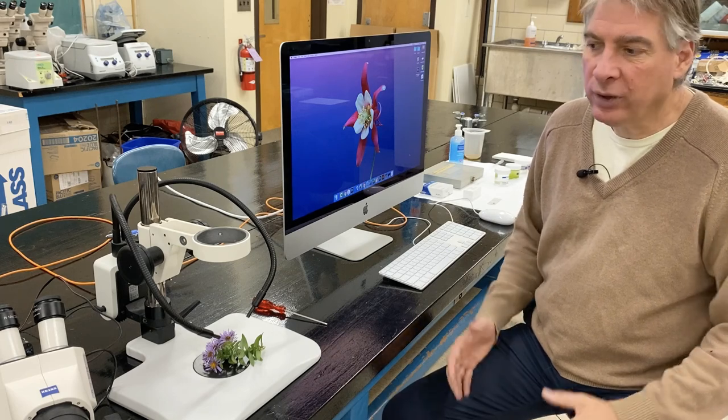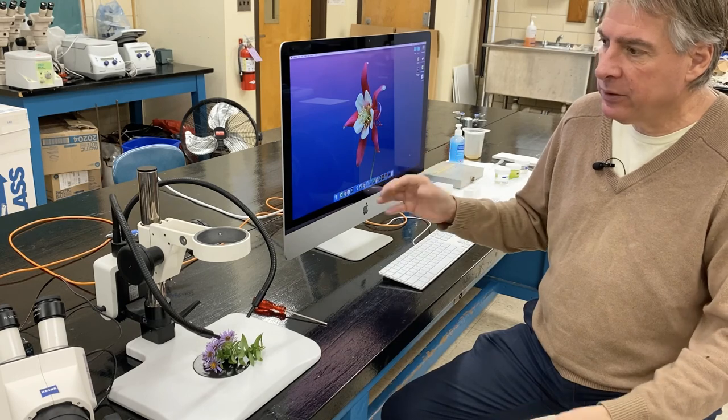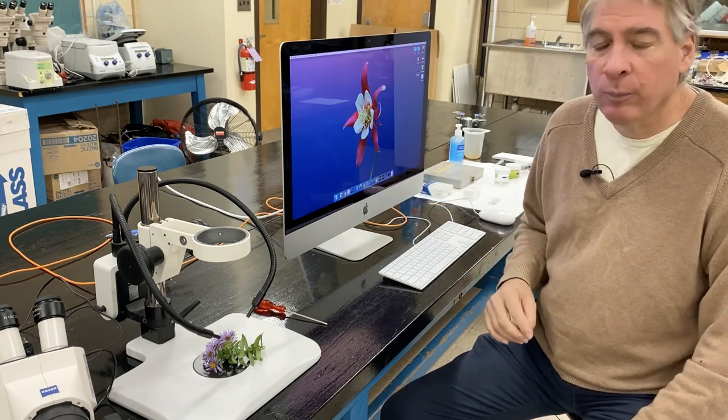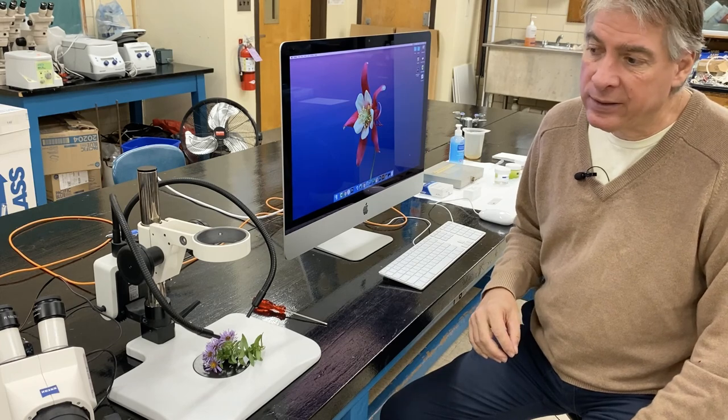Hey everyone, welcome back to Biological Imaging. I'm Joe DeGeorgis. Today we're going to switch things up a little bit. Instead of using the compound microscope, we're going to use a stereo, or what's commonly called a dissecting microscope.